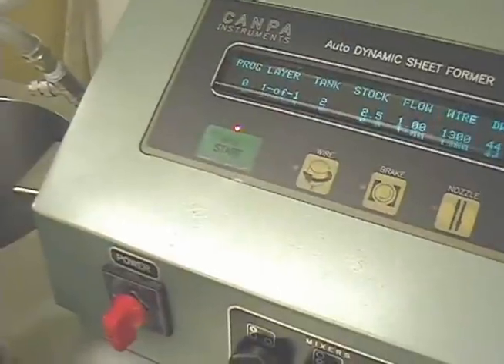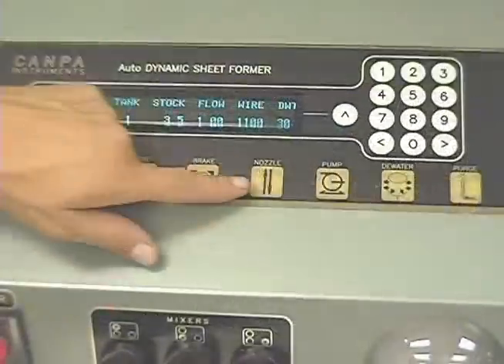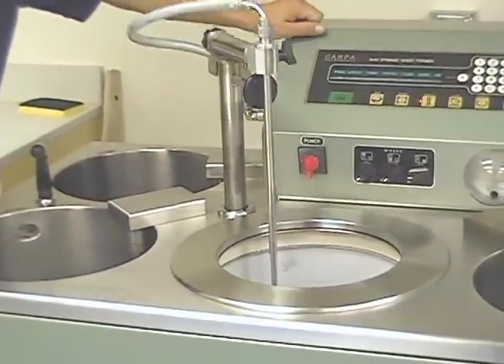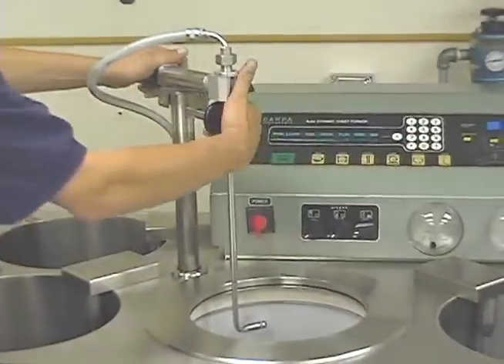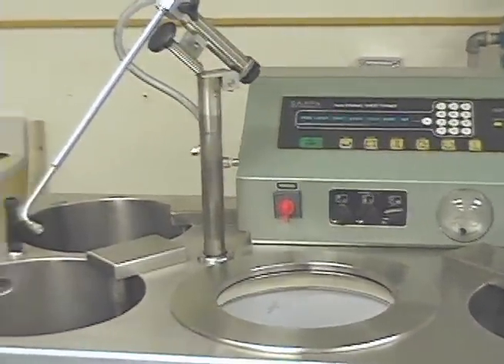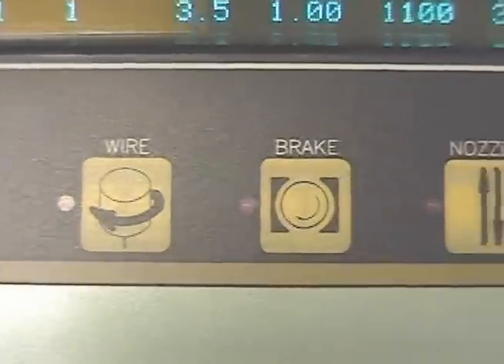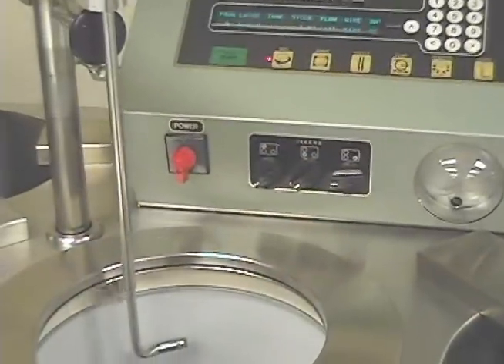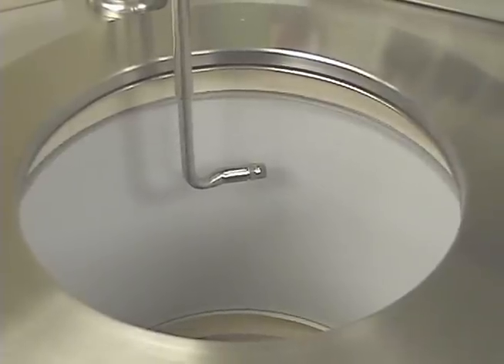The mixer control for each tank is located to the right of the main power switch. This is a demonstration of the manual control of the nozzle. Nozzle movement is initiated by pressing the nozzle button and stopped by pressing it again. Free access to the centrifuge is gained by swinging the nozzle mechanism completely out of the way. As the ADSF is a completely automated machine, performing the paper making process using the manual controls is not recommended. Manual controls are primarily to be used for maintenance activity.